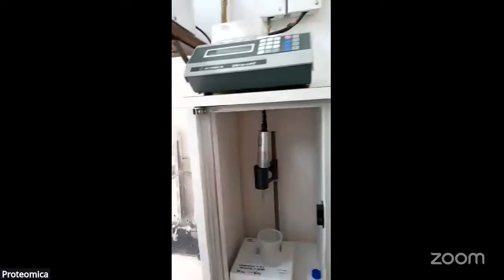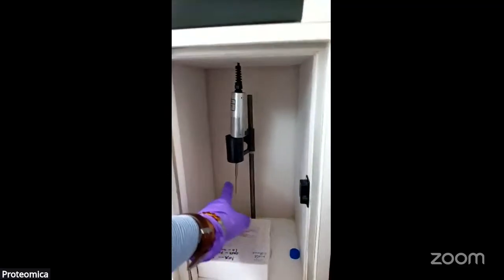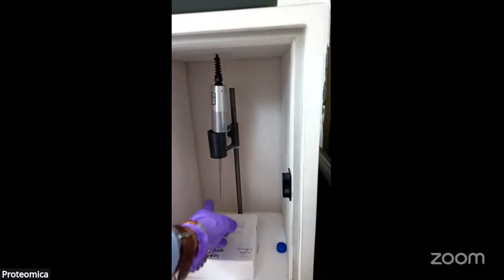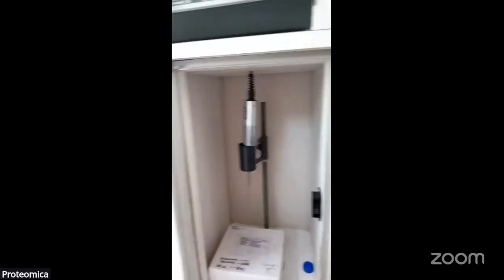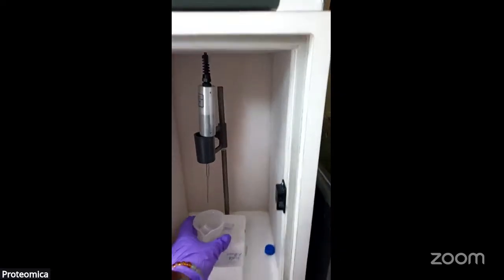So this is the sonicator which is generally used. You can place your samples inside the sonicator. There is this probe which produces the sonication, 5 seconds on and 5 seconds off. You can sonicate your samples by dipping this inside the tube, and 4 degrees is maintained with the ice, because this kind of sonication creates a lot of heat.